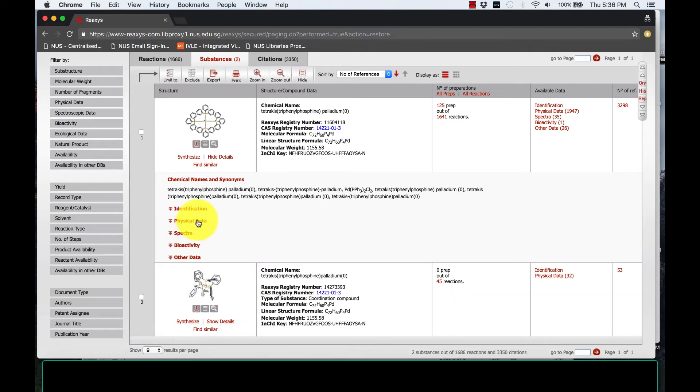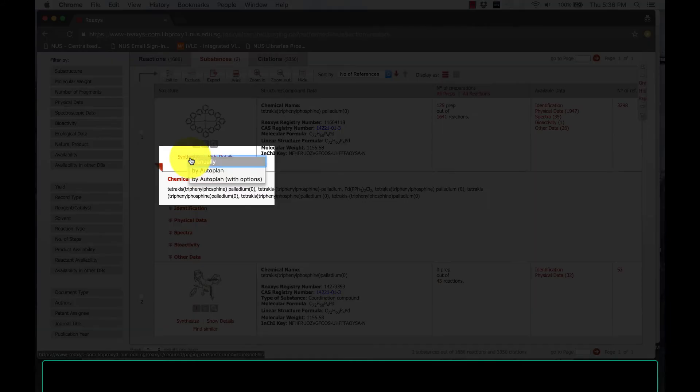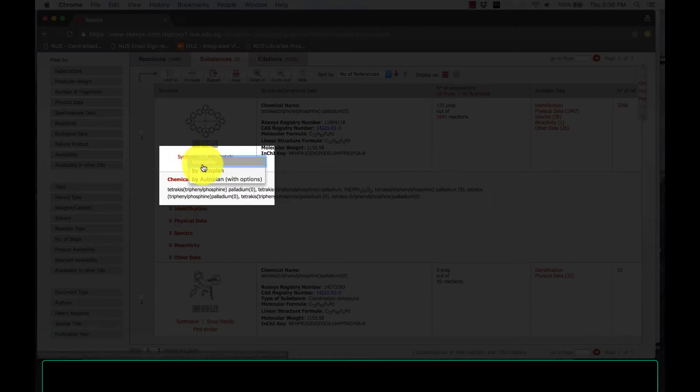Next, I can even find ways to synthesize my compound. Now, go to the Synthesis option and click Auto-Plan. Adjust your settings accordingly and they will auto-plan for you.